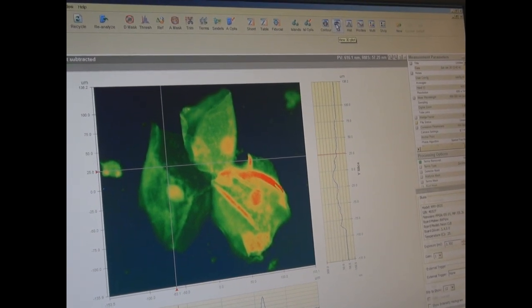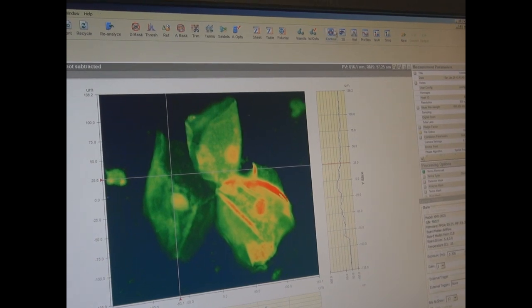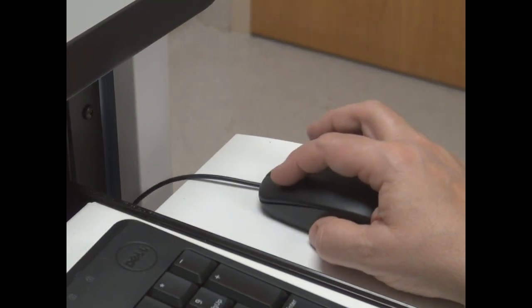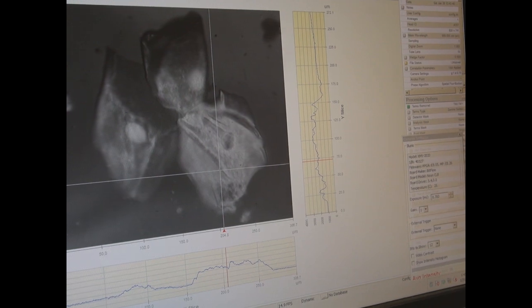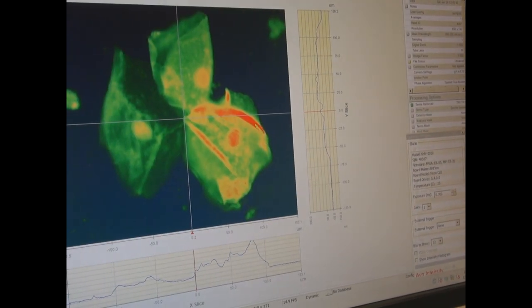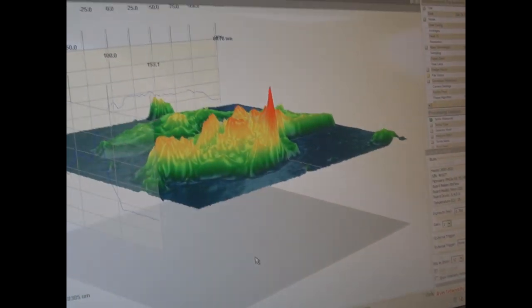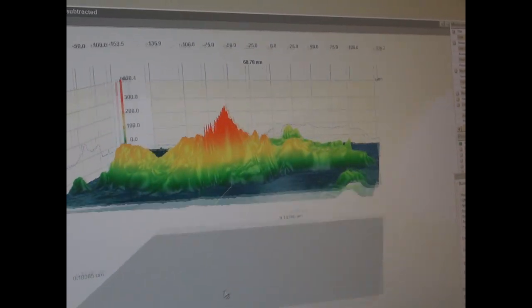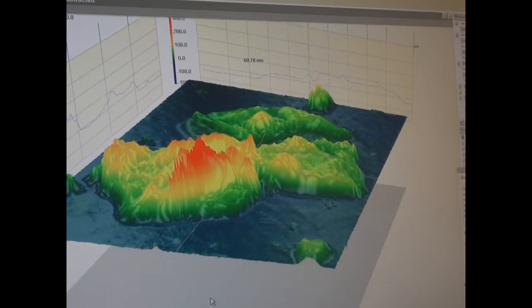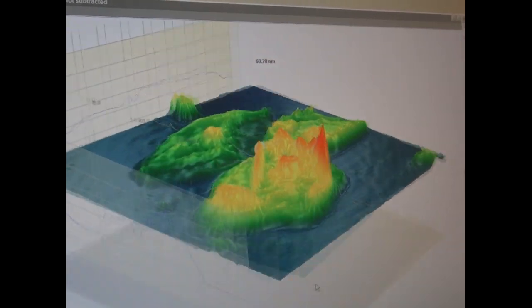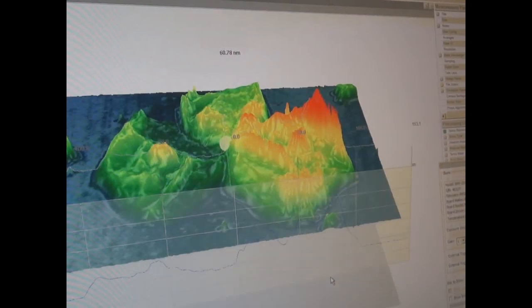Can you click between that view and a phase contrast view? Yes, I can. Back to the analyze surface and look at the contour. Here we can see the topographic plot. We can pick our detail, we can pick our scale, we can even change the color coding if we want. It's quite flexible in that way.